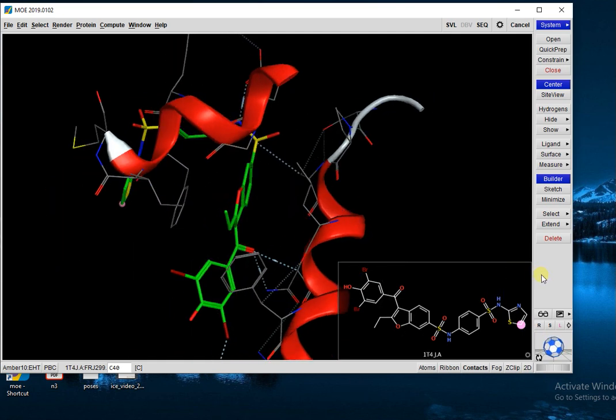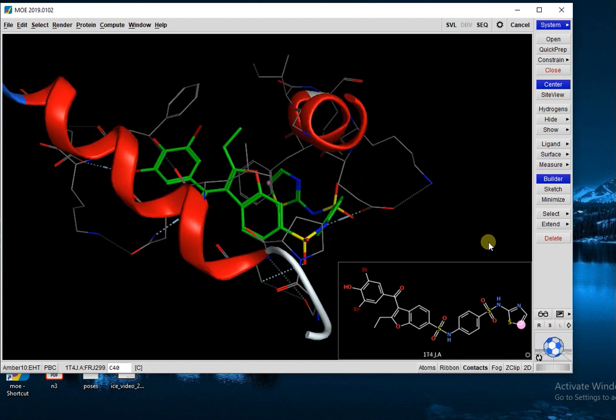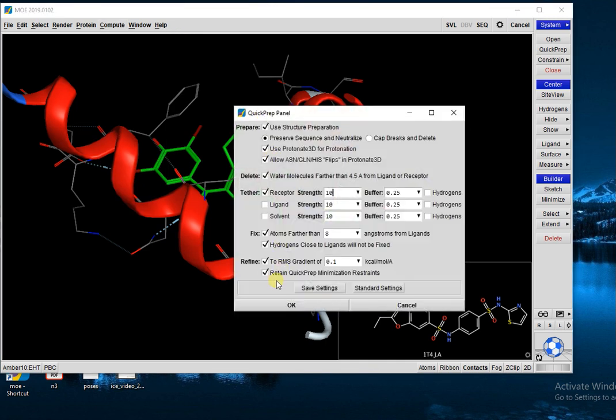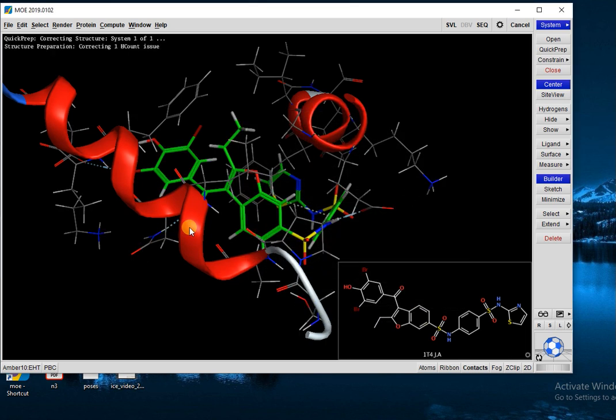After changing the color and removing water molecules or any other extra ligands that are attached, next step is Compute, Prepare, and Quick Prep. In Quick Prep, keep the gradient at lower and press OK. It will take some time.